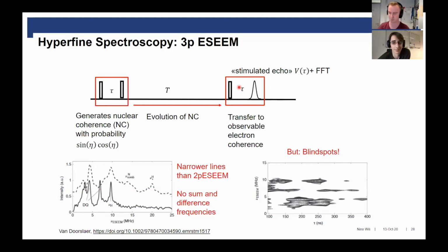I like the question because my last paper is basically on a spin locking technique, but it's not very usual to do this because, again, you usually cannot lock the whole spectrum. You just lock a very small part, and then it's usually not really a T1 rho that you measure. It's just some decaying magnetization that comes from very different pathways.